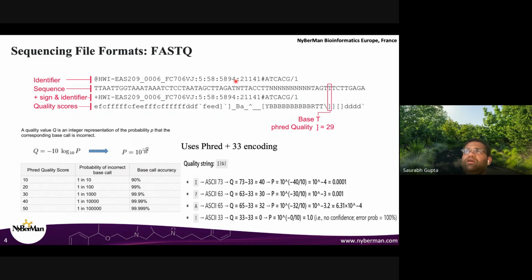You see how meticulously the complete information of where exactly this read is coming from in the flow cell is stored in the read ID, right? Which sequencer, which run, which flow cell, which lane, which particular matrix, and the X and Y coordinates inside that matrix. Then followed by a hash, we have something called the index. Remember I mentioned the pooling of the samples, right? I'll have a slide later where I'll explain a little about what we mean by pooling. This 6-digit nucleotide refers to the index for this particular sample.